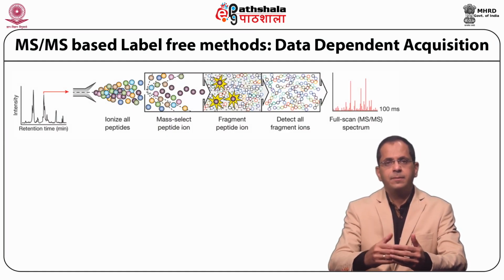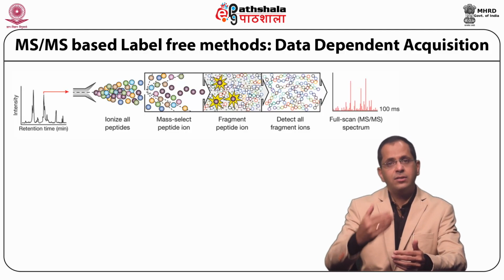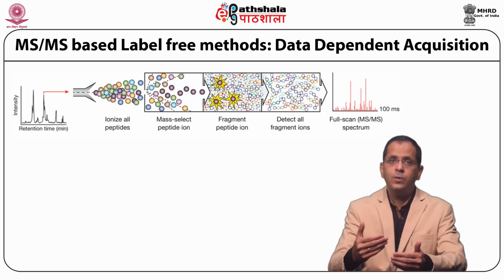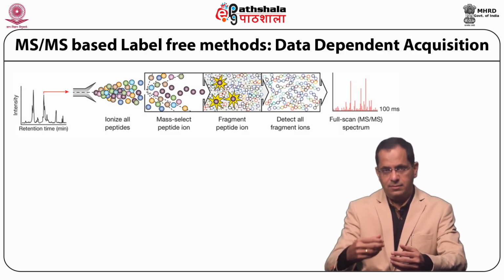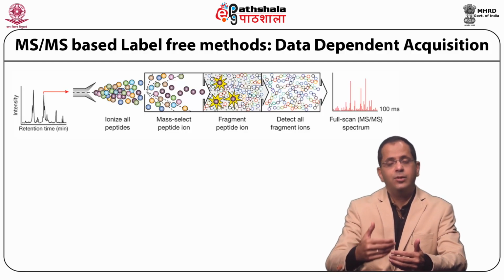First of all, the principle. Peak intensity of any ion should be proportional to its abundance, which is the ion signals in mass spectrometric analysis. Recent advances in LC-MS approaches have allowed correlation between protein abundance and the peak areas. That is, the number of MS-MS spectra has widened the choice of analytical procedure in quantitative proteomics.